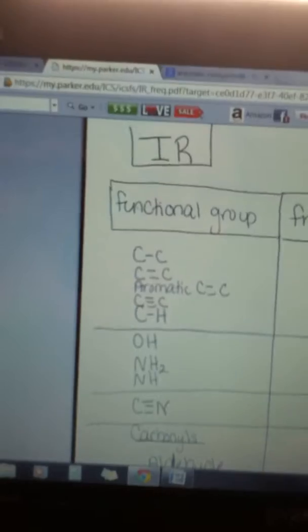Now, if we look at the distinctive peaks, let me go down to it. So 1500 or over, you can go ahead and look on over here. So we have a distinctive peak at 2900. Then I flipped over to our list here. Now, when I was looking at the IR for around 2900, there's a few things. So obviously you have your C with a single bond to an H, and that's within that range.